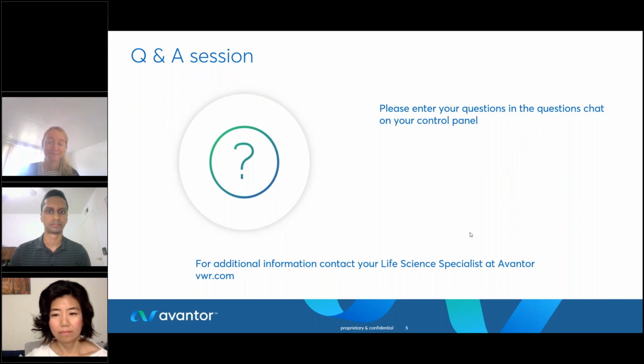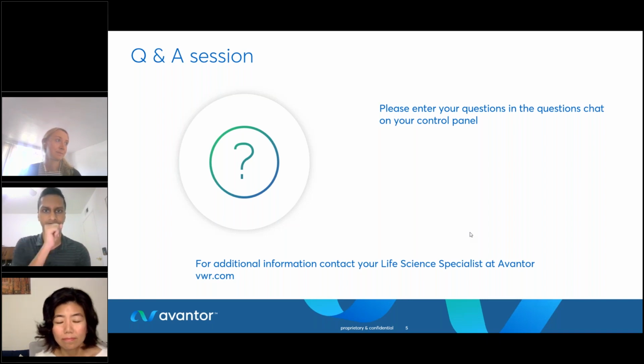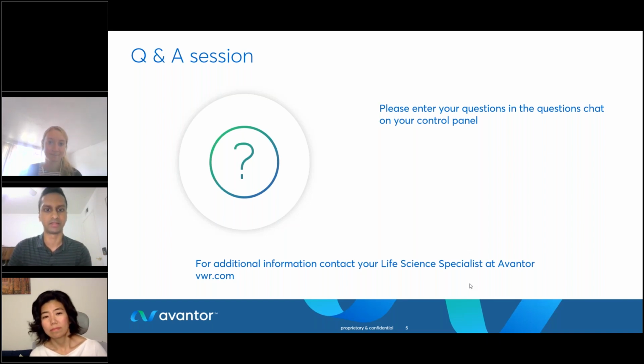Thank you, Sarah. Let's move on to the next question. What kind of translocation occurs at the motor enzyme? Does the single-stranded DNA get pulled through the nanopore 3' to 5' or 5' to 3'? Aaron, would you like to take that one? Yeah, I can definitely take that one. So the adapters are ligated to the 5' ends of the DNA molecule, so the translocation occurs from the 5' to 3' direction, and that's the same orientation in which the data is written.